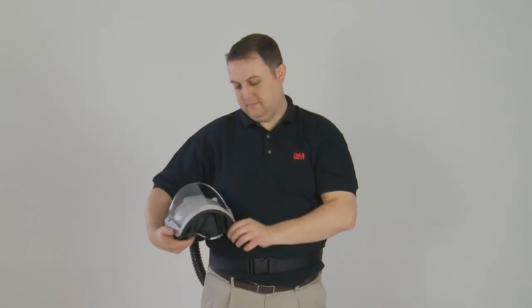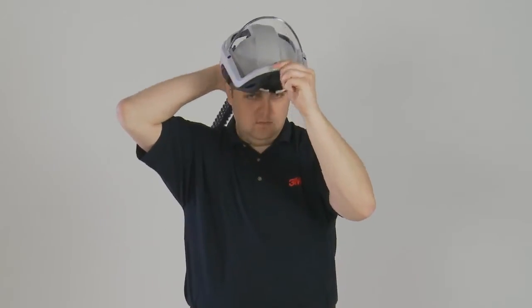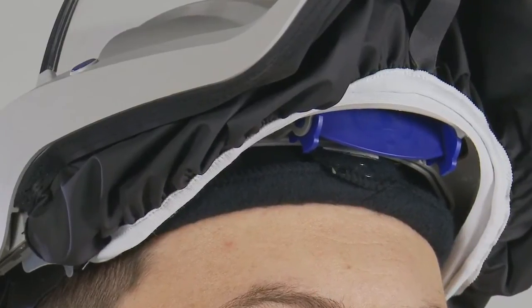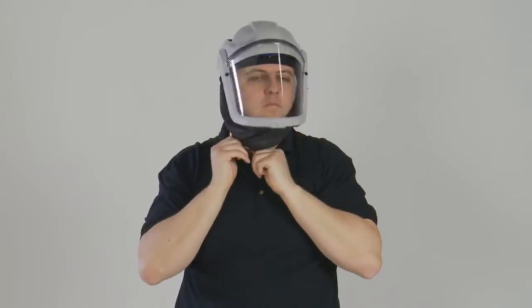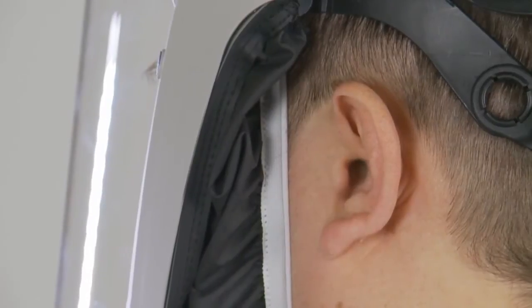For the M100 series, fit the head top with the visor in a raised position. Make sure that it is held firmly and comfortably. If necessary, adjust the fit as described before. Switch on the air supply and lower the visor into the down position by pulling on the loop until the face seal is under the chin. Ensure that it is correctly positioned all around the face and ears.